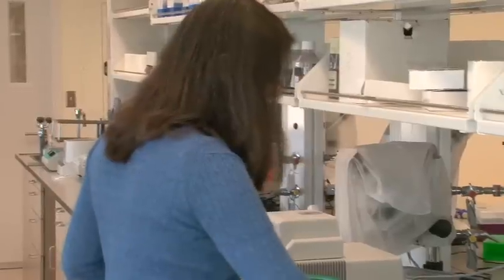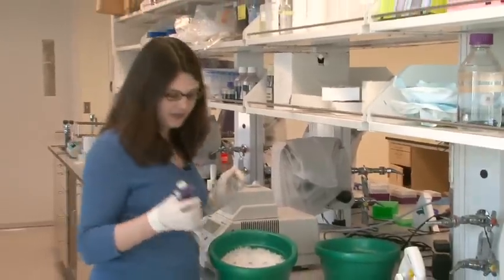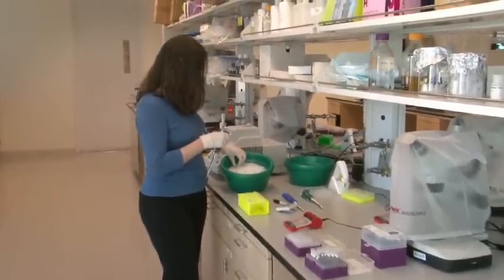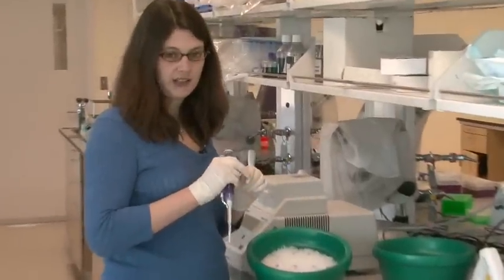So I'll be using my pipette to transfer, for each sample, a small amount of the liquid into the small tube.